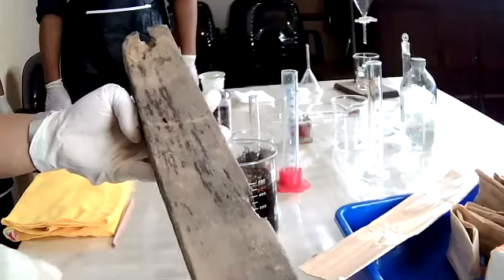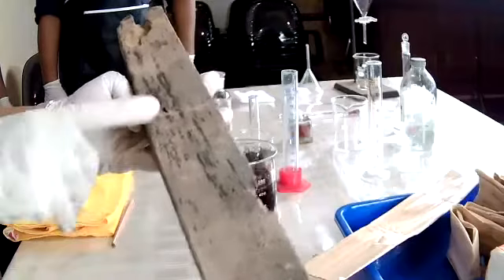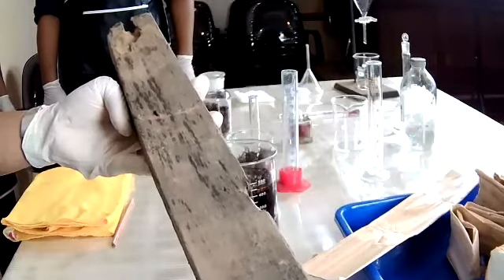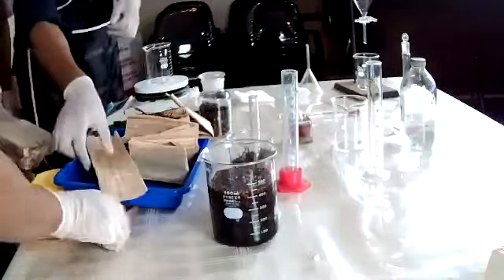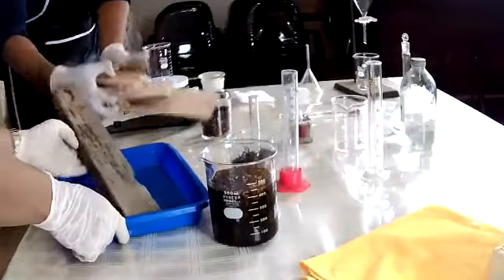And usually you can find woods like this, it's basically in the process of deteriorating. And then what we're going to use today is to apply the solution that we have made.